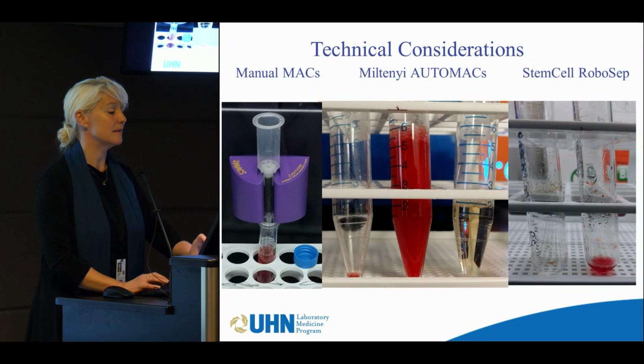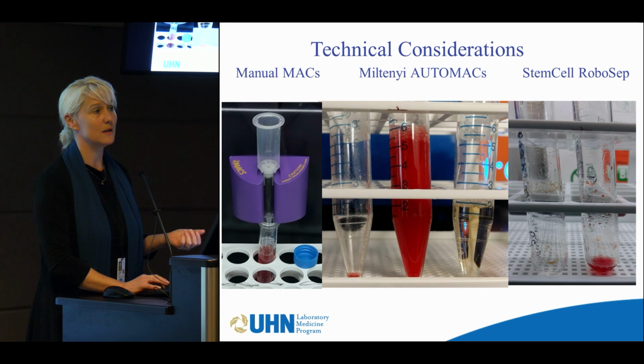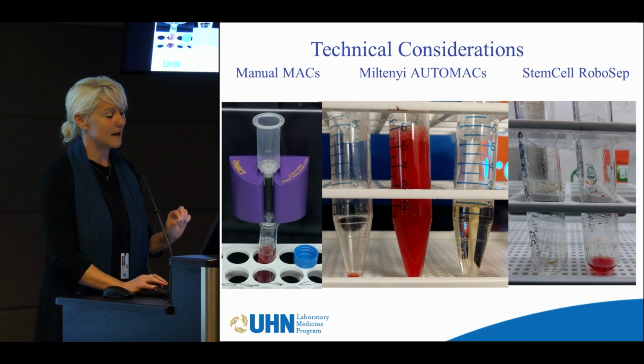But if you look at the tube, this is the original tube that went into the system, you can see there's residual red suspension in both the Miltenyi and the RoboSep, and this was residual volume, and we talked to both of them and said we need to address this because there are smaller pellets, and they both worked with me.